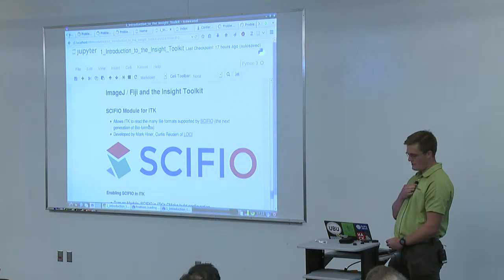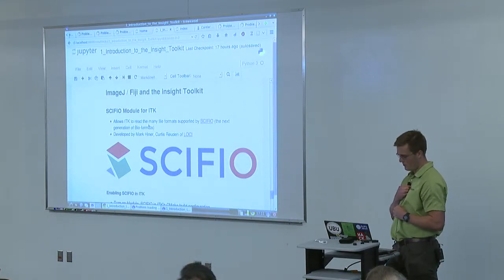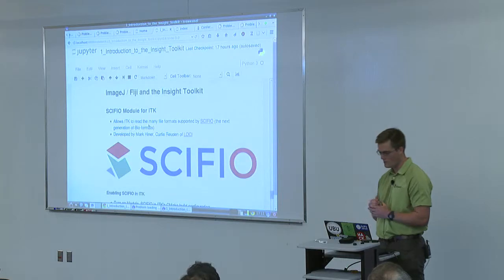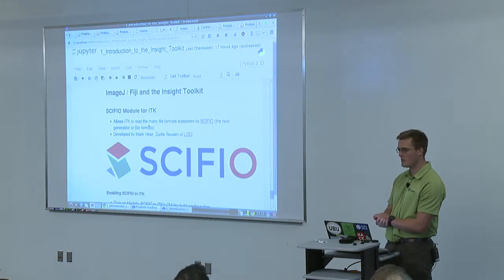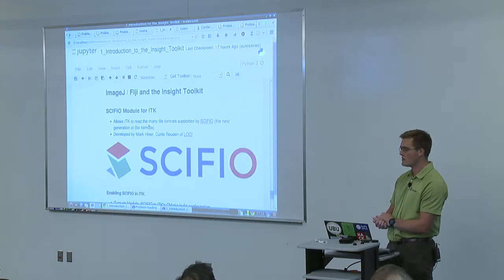ITK has support for many different imaging formats, but this really brought in better support for a lot of the microscopy formats. And again, really big credit to the guys at LOCI. If you get a chance to support them, I highly encourage it.